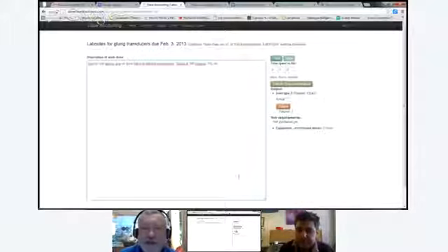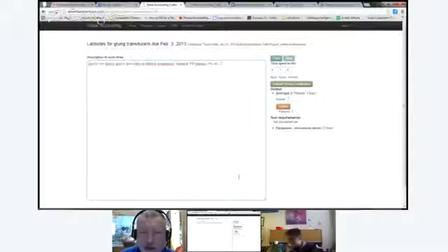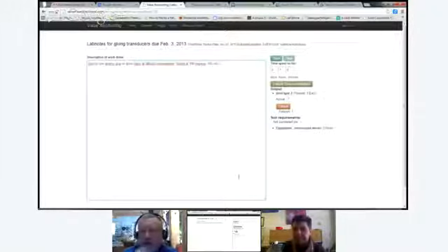It's easy for me to use when I'm developing, because now you've got some bugs in there. I would like to get into the raw data to work on those without messing with your system. So I could just take that whole database that's all in one file and drop it on my computer. With the industrial strength database, I can't do that. It's a much bigger system. But we need to be there when you're going to start having other people using this.